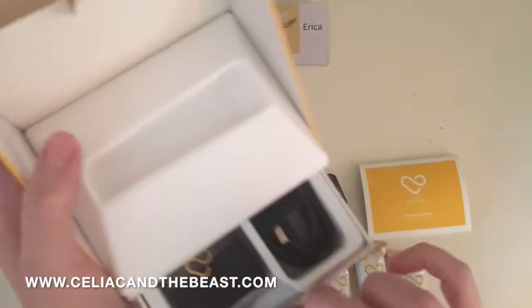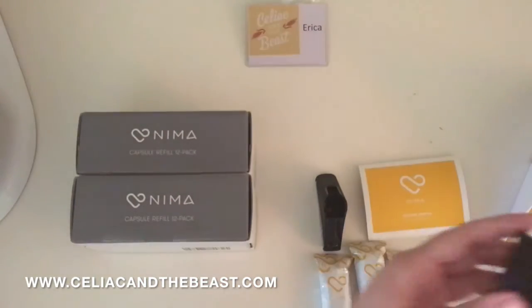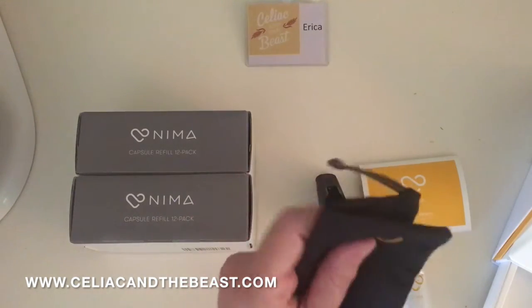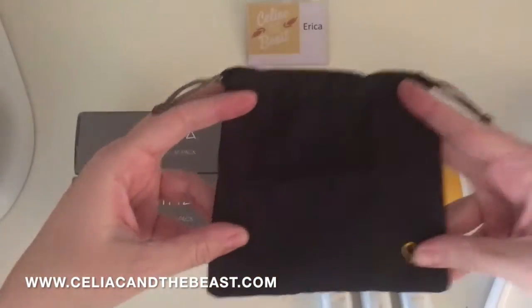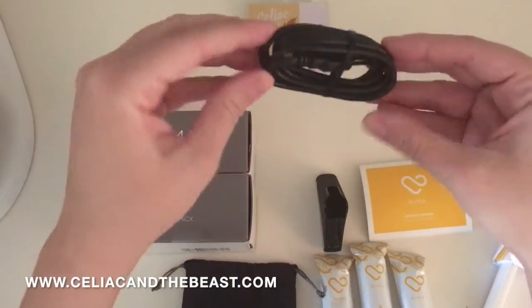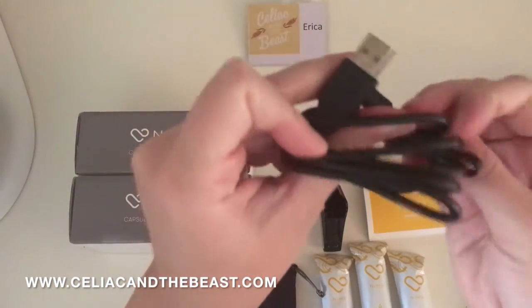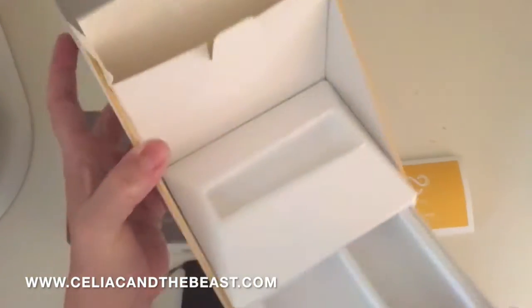It just keeps getting better, you guys — it's like the never-ending package! Okay, a little bag for the Nima sensor. And then also a cord — I'm assuming this is what hooks up to the app, but we'll find out. And a rubber band! Free rubber band with every Nima purchase. I think the box is now empty — it seriously came with all sorts of surprises.